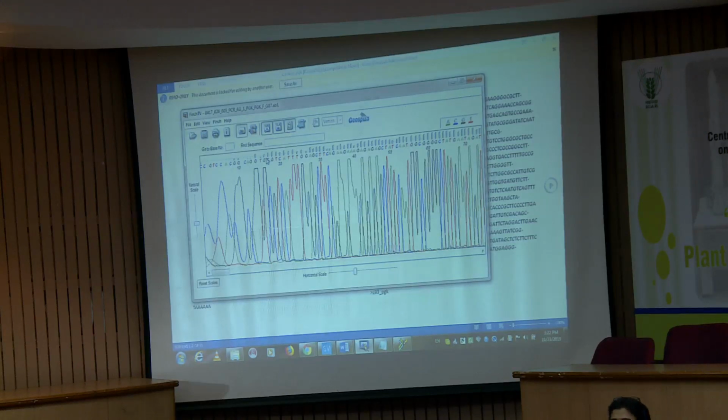So you always consider, let's suppose your requirement is the initial 10 bases only, and you don't want to miss any base from your sequence, then in primer designing you have to design 50 bases upstream of that region. Got it? 50 bases upstream of that region, because that depends on your requirement.